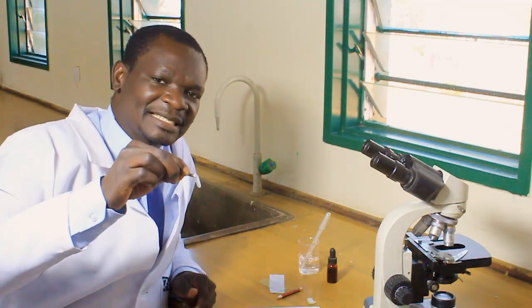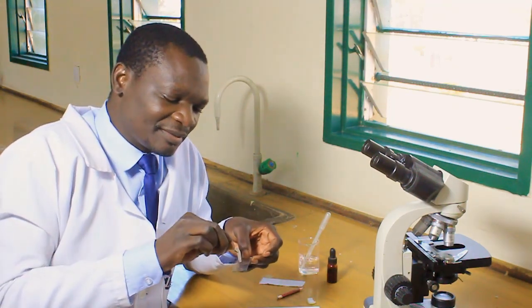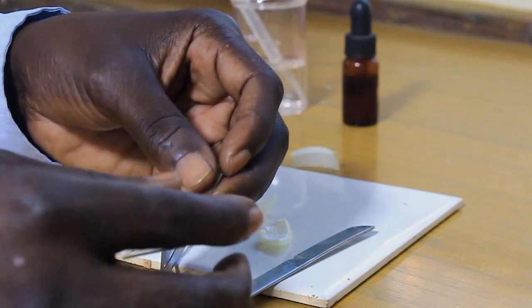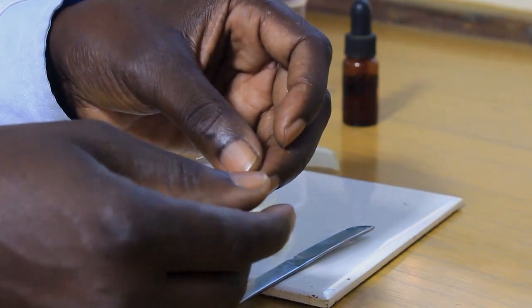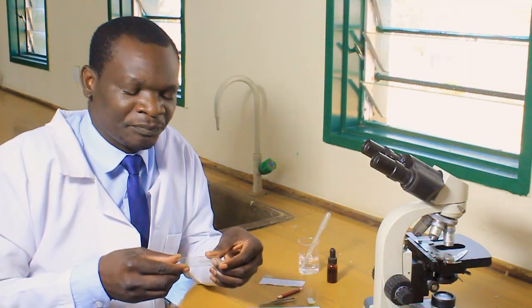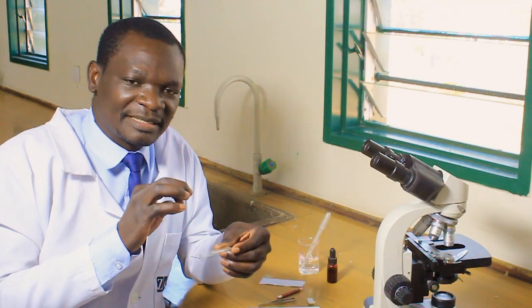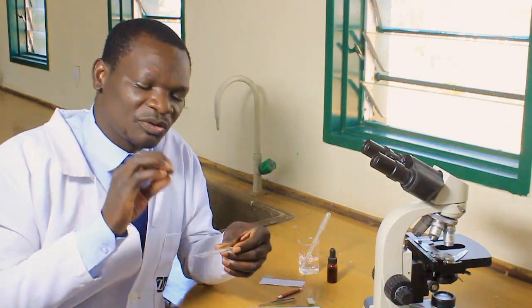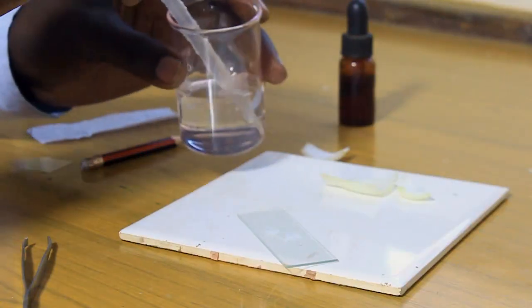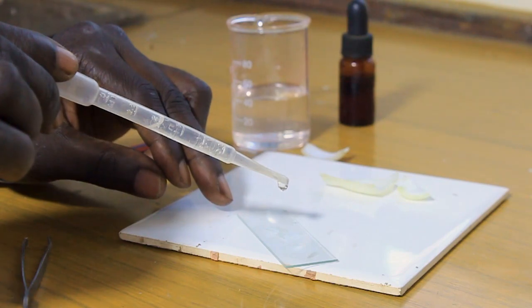Then place this skin on the glass slide. It must lie very flat on the glass slide — stick it there and use your fingers to ensure it is as flat as possible. When you are certain it is flat enough, add a drop of water on it, because remember we are preparing a wet mount. So add one drop of water, like that.